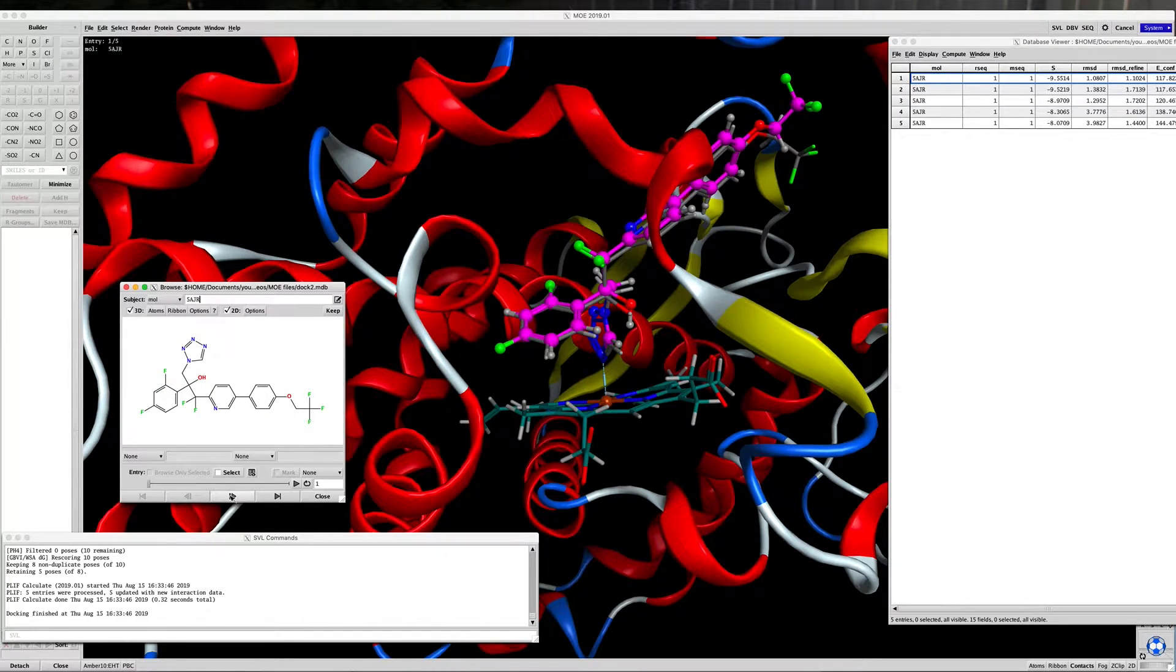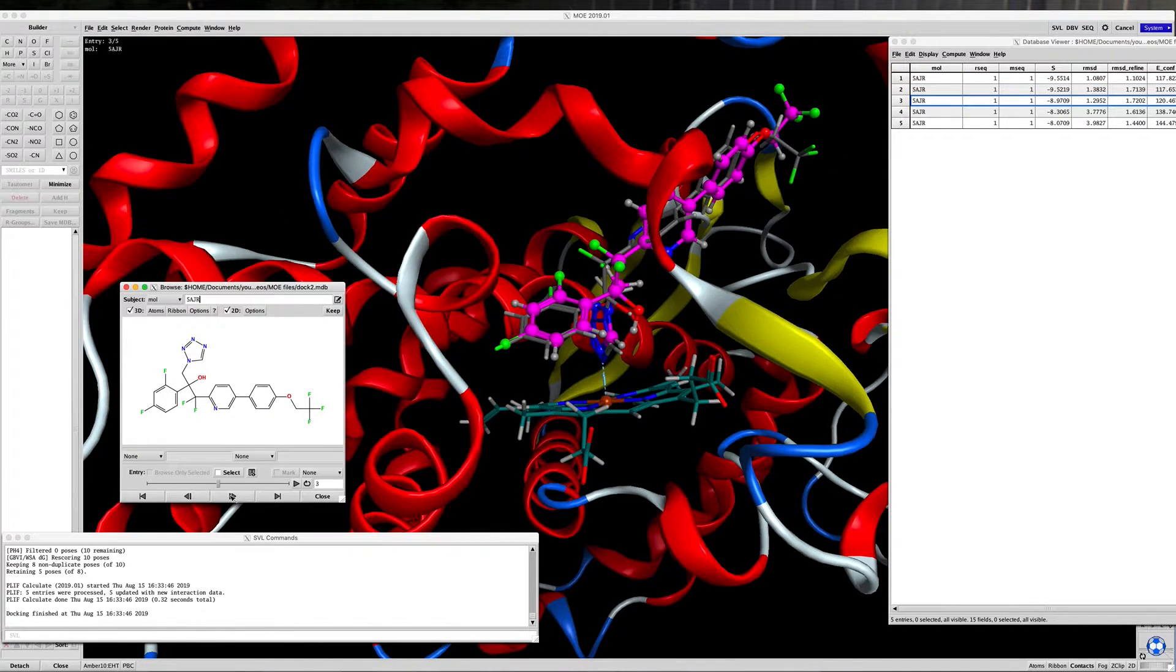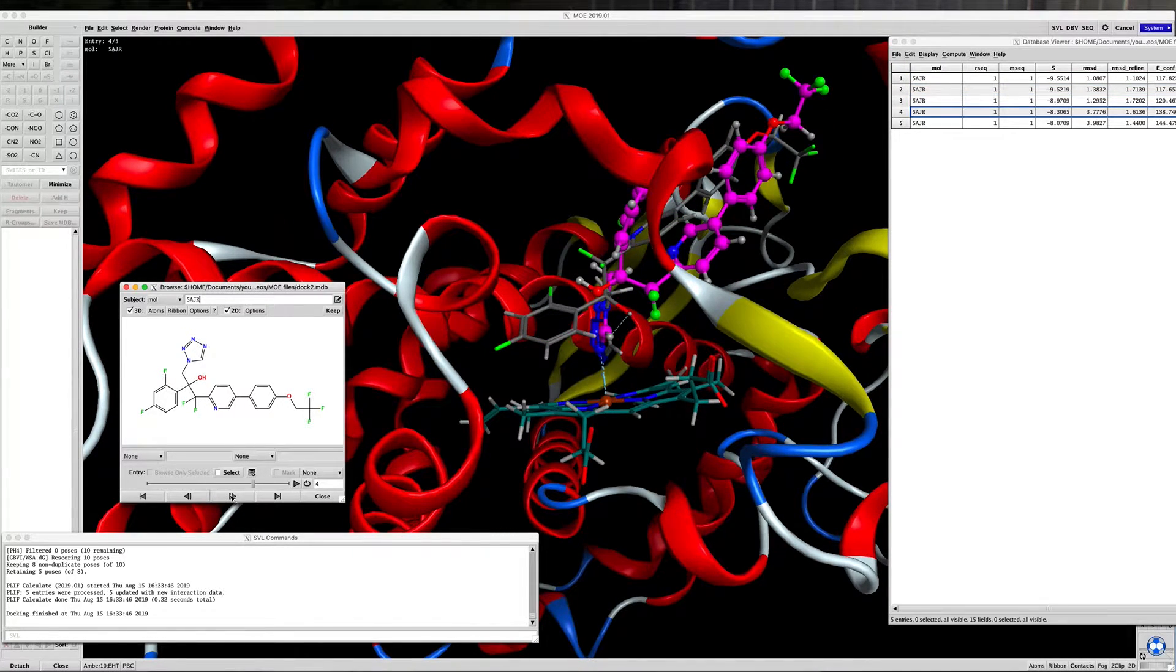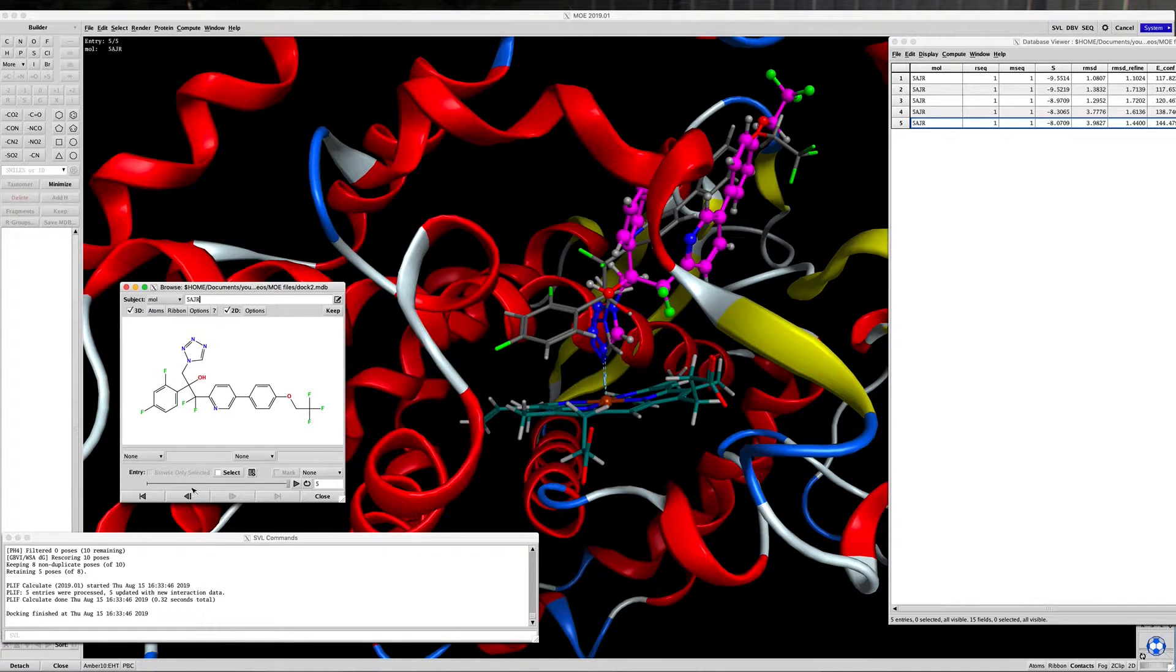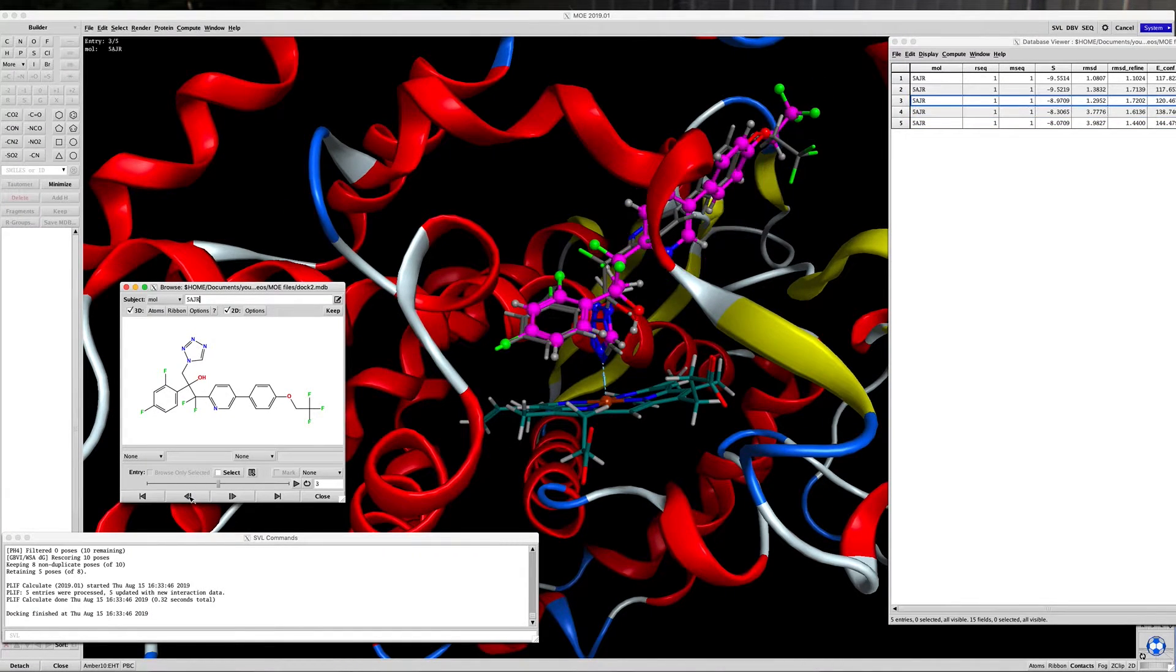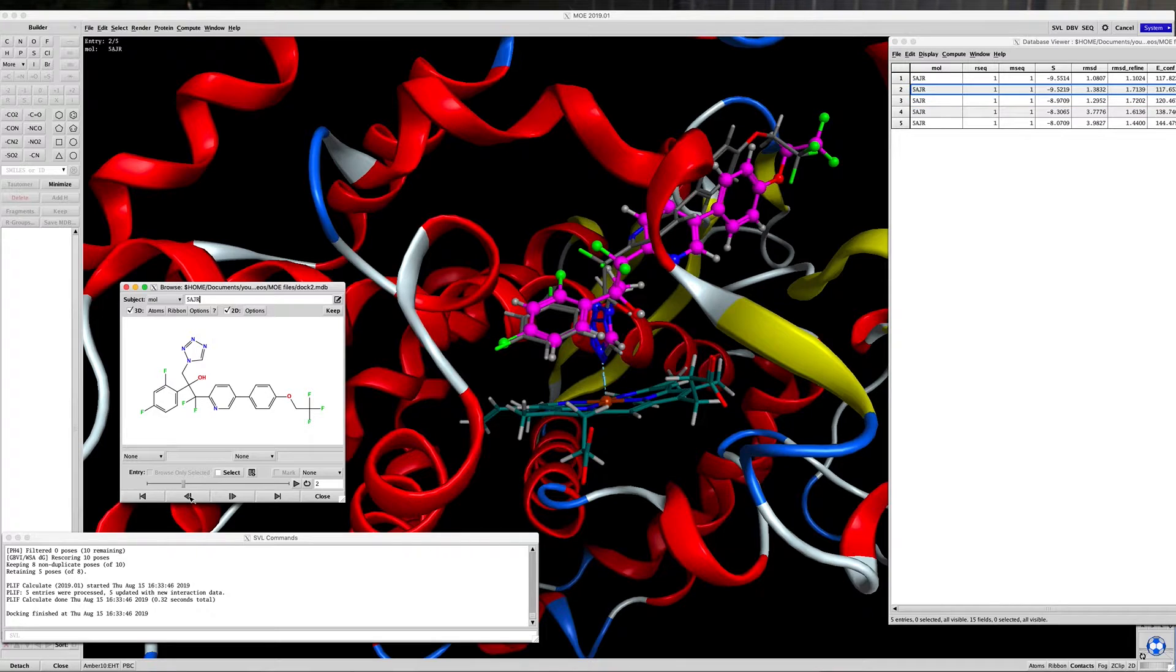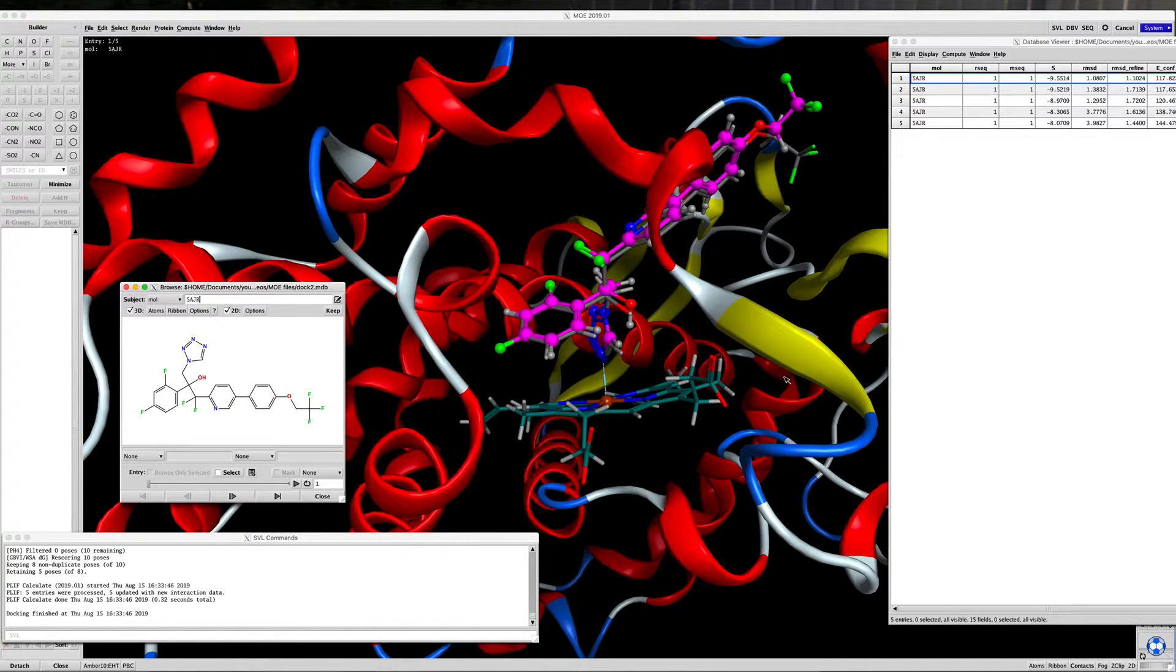As we scroll through, we see that we're getting interactions with the iron. There's some other alignments that we're seeing, but the top three are essentially completely overlaid, which is really exactly what we're wanting to see.